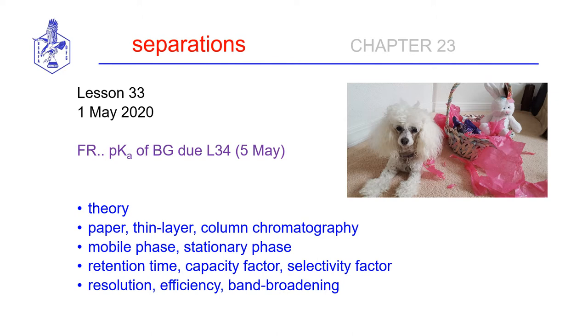And today we're going to begin the topic of separations. So in the realm of analytical chemistry, we oftentimes have to undergo a sample separation before we can analyze the many specific compounds within. So we are going to go over all of the details of the theory and the application of separations.